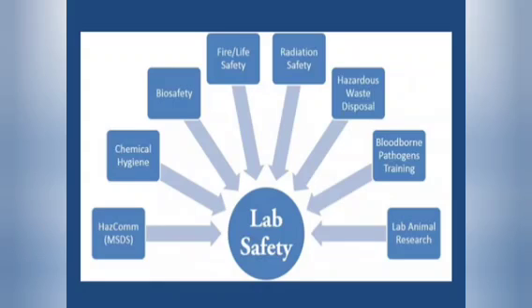The management of hazardous materials, chemicals, biosafety, fire, radiation safety, hazardous and biomedical waste disposal, handling bloodborne pathogens, and if you're running a laboratory which has animals in it, then you have to talk about the precautions to be taken when handling animals.